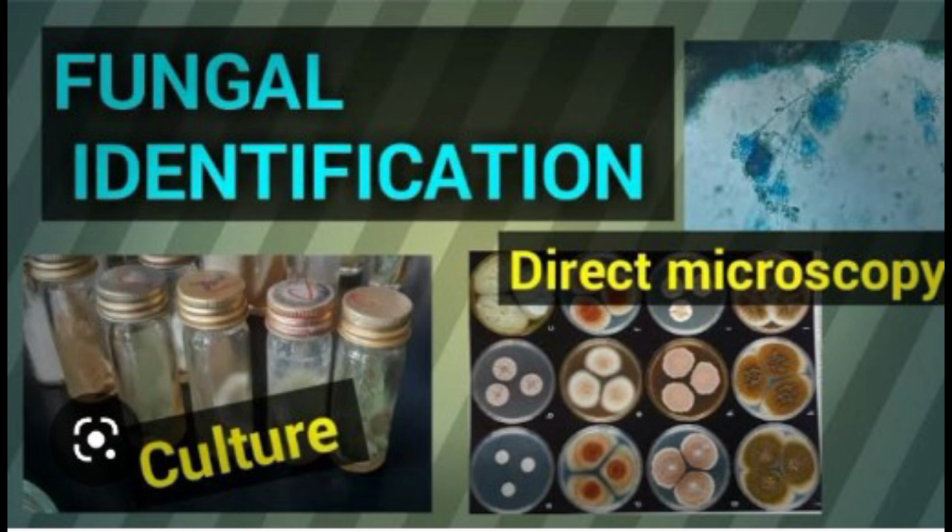Procedure: place a drop of lactophenol cotton blue stain at the center of a clean glass slide with the help of a wire loop. Place a small mass of fungal growth in the drop of stain. Tease the fungal growth with the help of a teasing needle and spread it in the stain. Tangled masses should be well separated. Place a cover slip carefully over the drop so that no air bubble is present. Examine the preparation under the high power objective of the microscope.